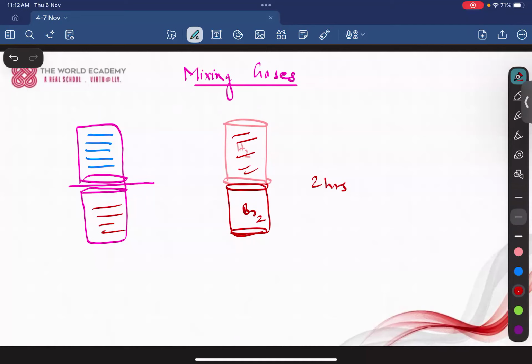So what is the conclusion of this experiment? When you are putting two different colors together, they are mixing without any effort. It means they have their inner tendency to flow, and because of the flow they are mixing, right? This is a gas, so it is usual behavior to go up. So why is hydrogen coming down?